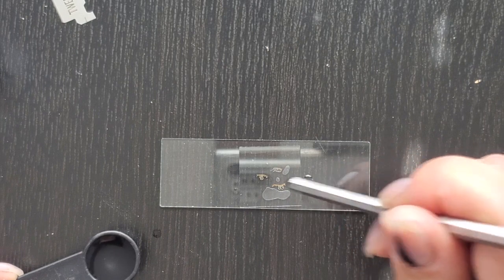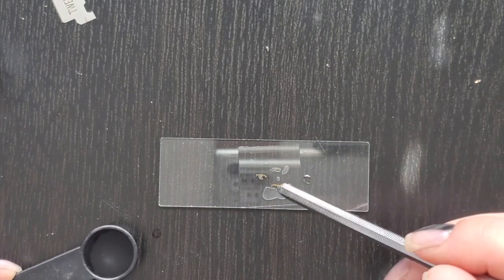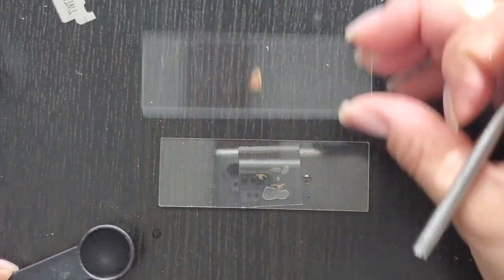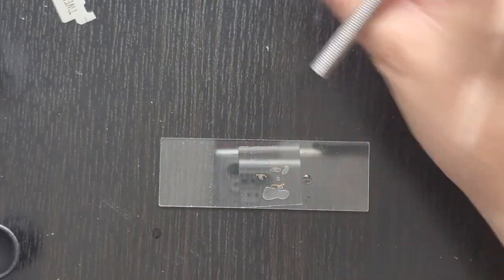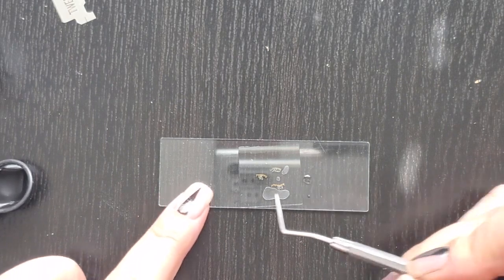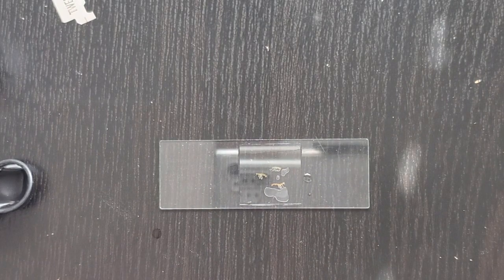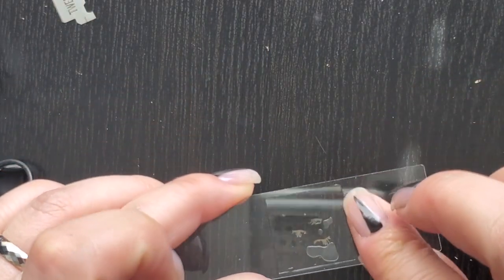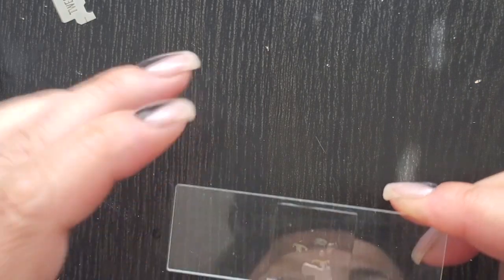If you notice your sectionings weren't very good, you can always just make a squash mount based off of already something like this, instead of grabbing, let's say, this piece and making a squash mount. That would not be ideal because it's too messy. This one, at least, you have the minimal amount of cells and you can really look at the cell type, basidia, basidioles, etc., cheilocystidia, pleurocystidia. I actually have no idea what this species has because I didn't do my homework before I did this, so I'm just going to let it be a surprise and see what we get.